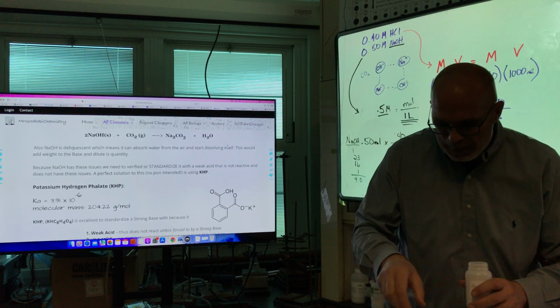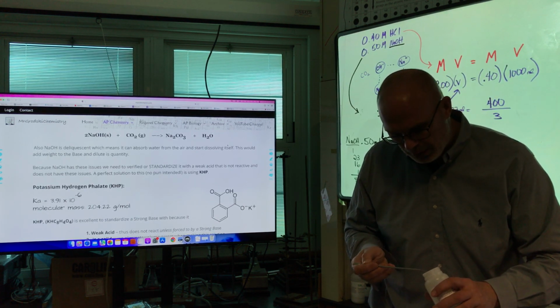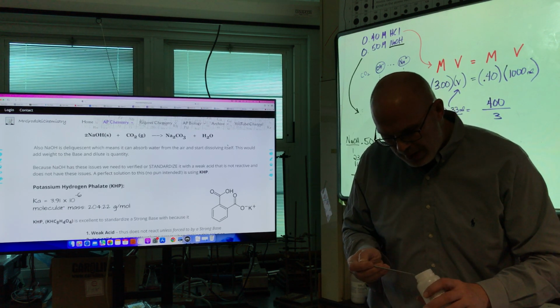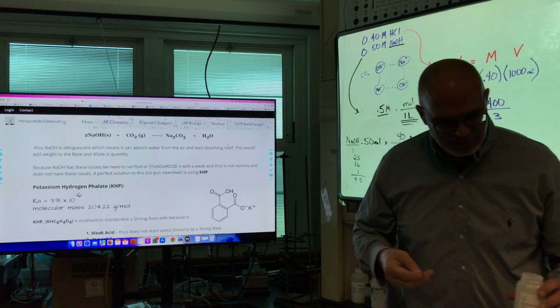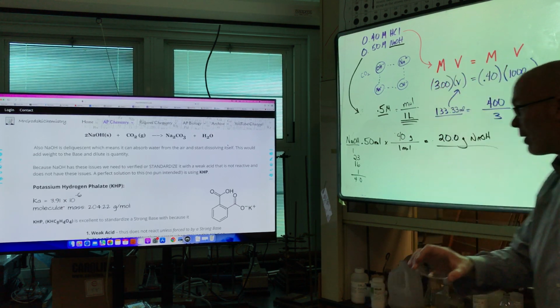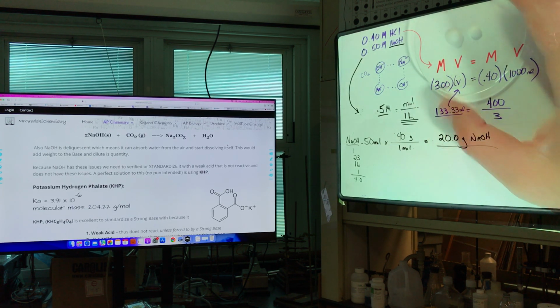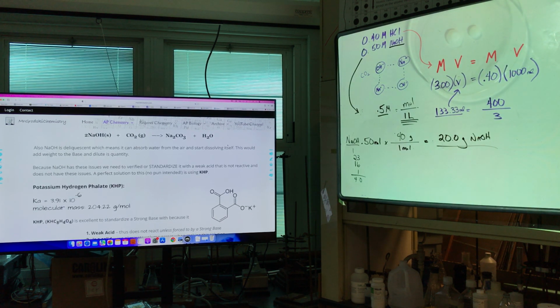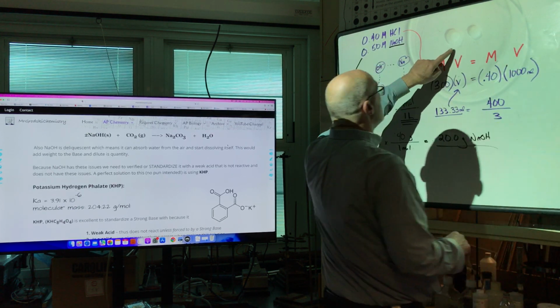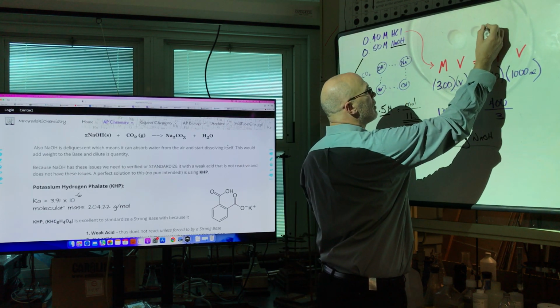So what I'm doing here, party people, is I'm going to put a pellet of sodium hydroxide. They come in like little round pellets. And I'm going to put it next to the one I've had out cooking the last day. I feel this is like a cooking show. Okay, and you're going to tell me which one you think was sitting out overnight. So here we go. Okay, I know it's hard to see. I used to have a black piece of paper here, but any case, here is my little pellet right here that I just put out.